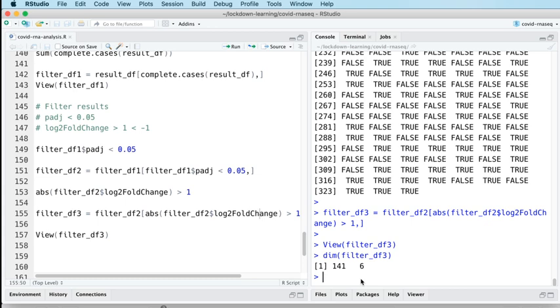But today, what I want to look at is some very typical plots that we might want to create for the gene level differential expression analysis that we've done to this point. So we've looked at plotting generally, and I introduced you to ggplot2 a couple of weeks ago now, and we used ggplot2 to plot out some expression data from an example data set.